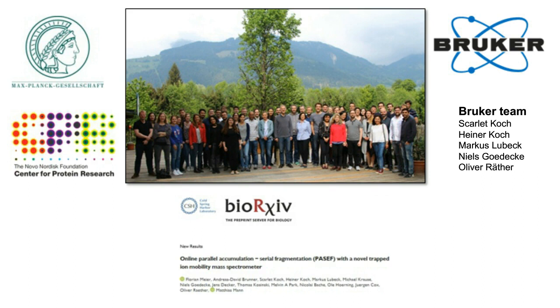And how are the precursors selected? So I guess this question refers to the precursor algorithm that's implemented in the PASEF acquisition engine. In this case, the precursors are selected in the full dimensional space, meaning in the ion mobility dimension and the m/z dimension, and the algorithm also takes into account the LC elution dimension, in a sense that precursors that are already sequenced are not going to be sequenced again.